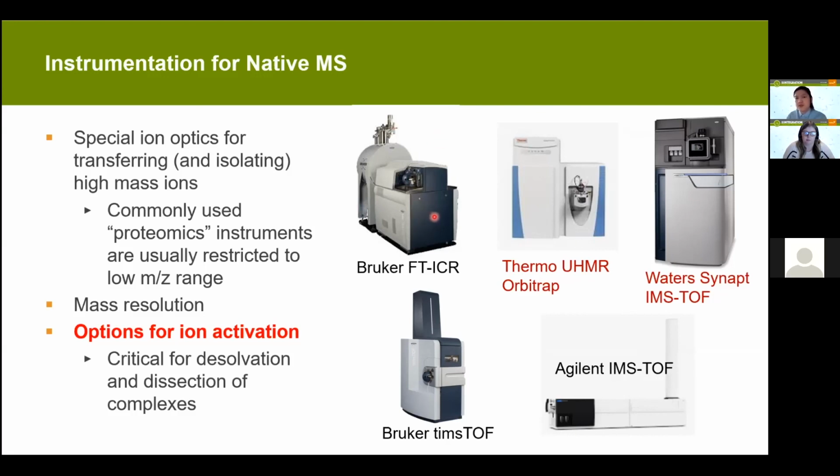When you are pulling the capillaries, you can set the parameters to pull a different size. It's not that easy because the control is a little bit limited, so a lot of times it's trial and error. But once you have that condition sorted out, you can check with scanning SEM, to check the size of the opening. Once you have those settings, you can reasonably produce the same size of capillaries.